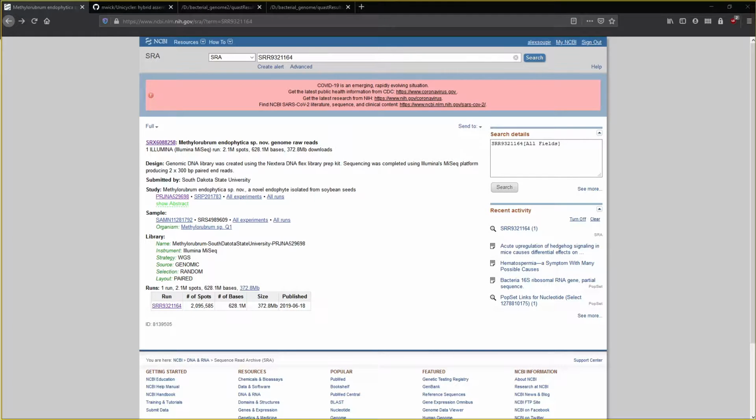Welcome back, everybody. Today I wanted to take some time to talk about whole genome sequencing for bacteria.